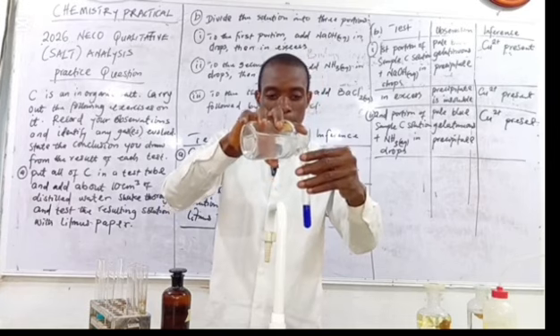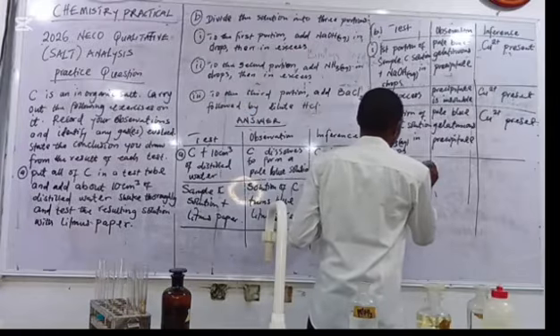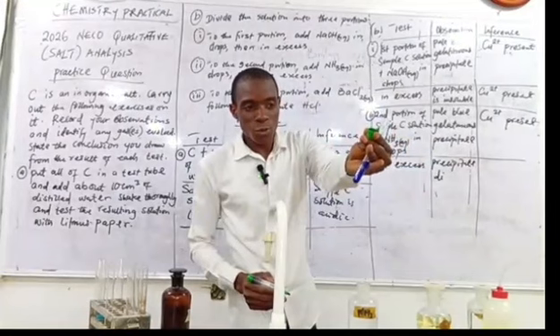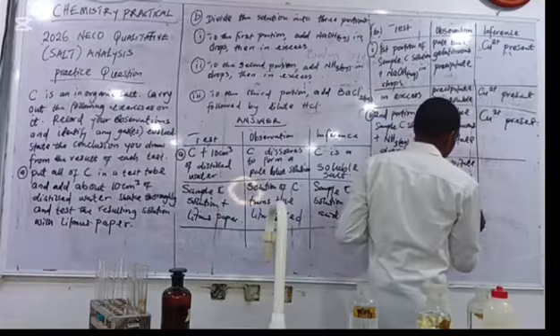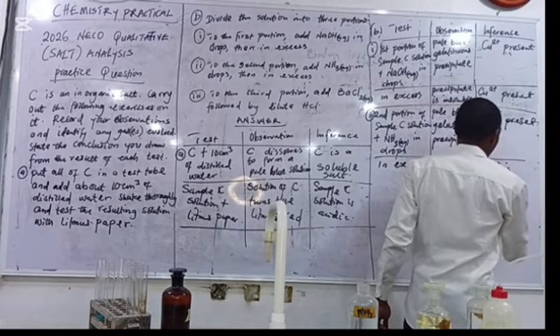You see what happened? It has become deep blue. In excess of ammonia, the precipitate dissolves to form a deep blue solution. So Cu2+ is confirmed.